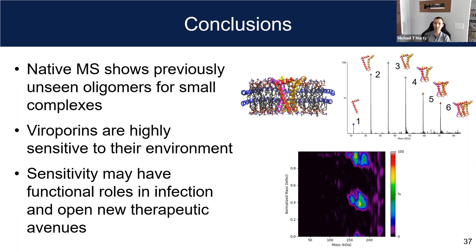We're trying to do some cross-linking gels right now, but the problem is in SDS, it's a pure tetramer. What runs on a gel maybe isn't pure, because the band is pretty broad, but it runs as a tetramer on an SDS gel. So we've got to figure out how to denature it. If you denature it and then put it on an SDS gel, it just folds back into something that's a tetramer.